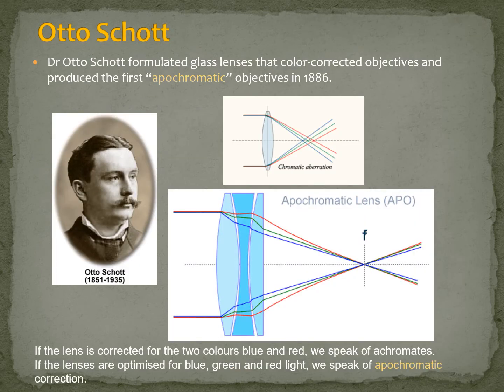The important thing was not everything was yet perfect, although we could have that power of resolution. Lenses had to be improved, and they continued to be improved for a long time, especially in order to correct the different aberrations, chromatic aberration, spherical aberration, and depending on the color that we were looking at, we would have different problems.